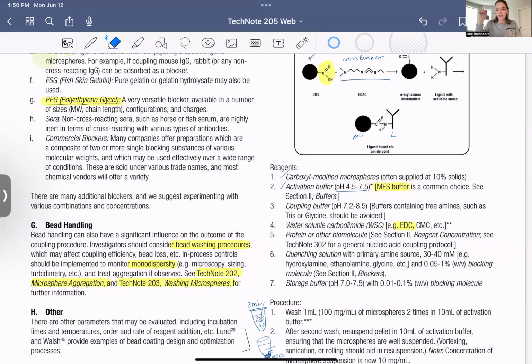The second thing you should be doing is, if you can optically see your beads, look at them under a microscope. Make sure that the size distribution looks similar. Make sure there are no clear massive clumps, or tiny ones. It needs to be as monodisperse as possible. And this is where you should be an absolute perfectionist. Get it as monodisperse as possible. You can also be using UV-vis spectrometry to estimate how much protein remained in the solution. There are just a ton of steps here. And so the characterization and the fine-tuning of your solution at the end is so important.